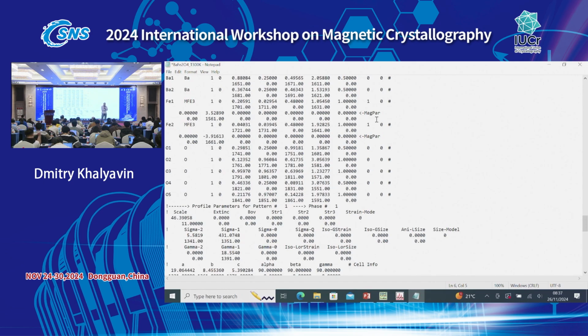But it's a fraction. One of the problems related to this kind of thing, and why he published that, is that in fact the absorption correction is not good. It's something that is not really physical. But unfortunately, it is a problem. And as I said, the only practical advice is just to fix the moment size to a physical value. It simply means that your data cannot deliver information about the moment size. Fix it to 7 maybe, and do the rest of the refinement.